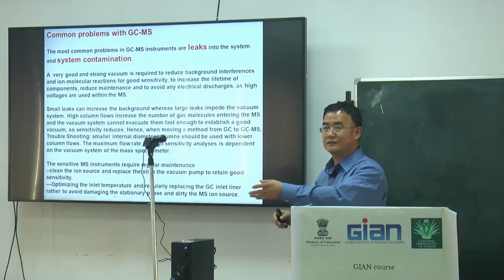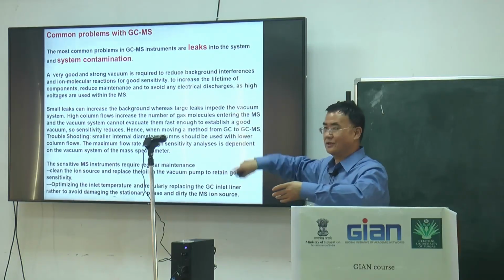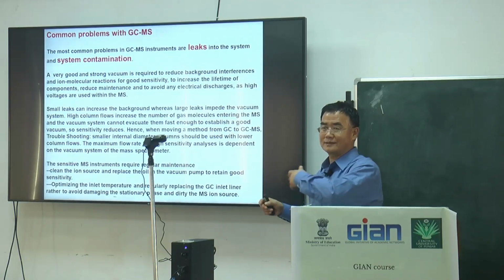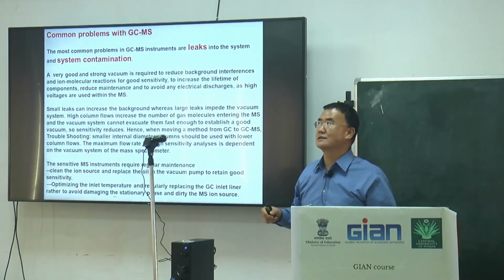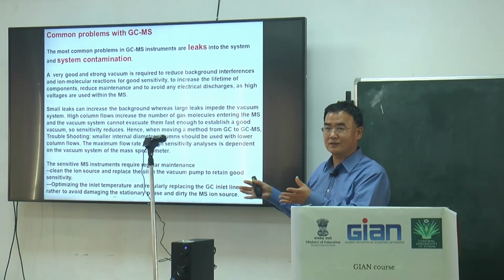If the inlet part is not controlled well enough, we will destroy the whole capillary column. In Chinese, they are like 4,000 plus, a couple thousand; it depends on the column.